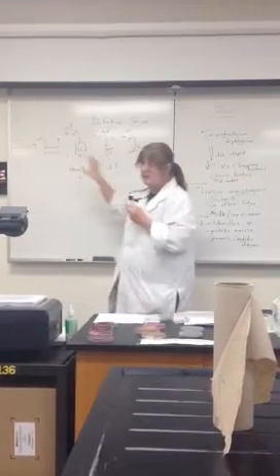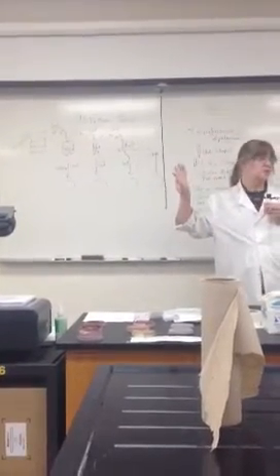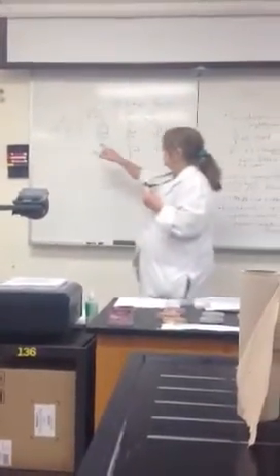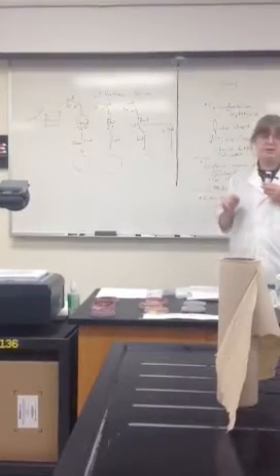Now, what you have to learn, these are the most basic dilutions you can do. They can get really involved. You can start doing half mil to 4.5, which is the same thing as a 1 to 10, but you don't have to know that. It is always amount added over total volume. Amount added over total volume.